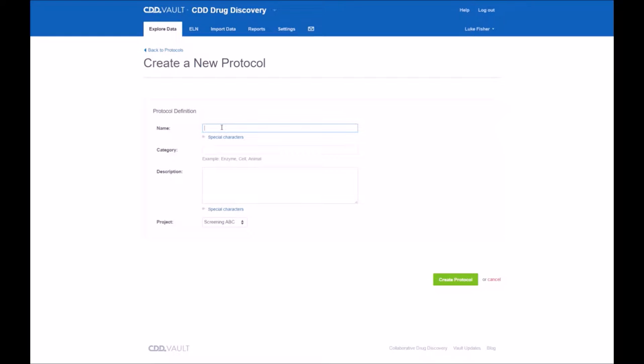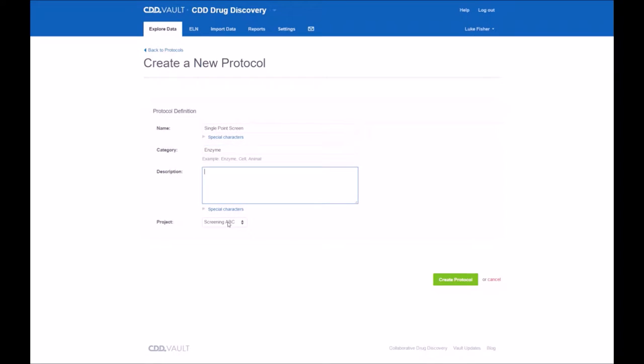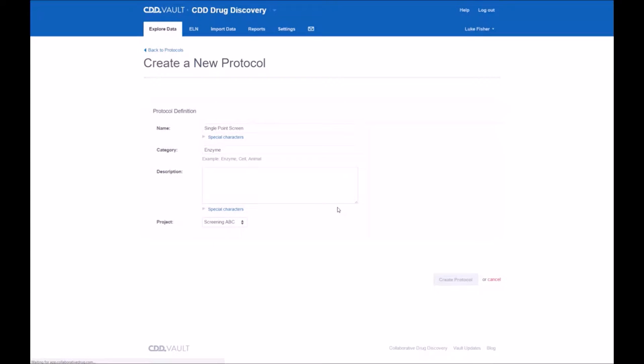Now, under the Create New Protocol wizard, simply give it a name, select the category, and provide a description if you'd like. Select the project and then create the protocol.